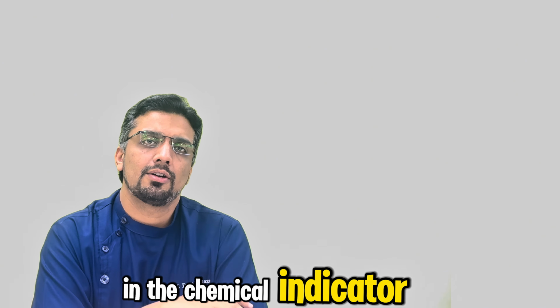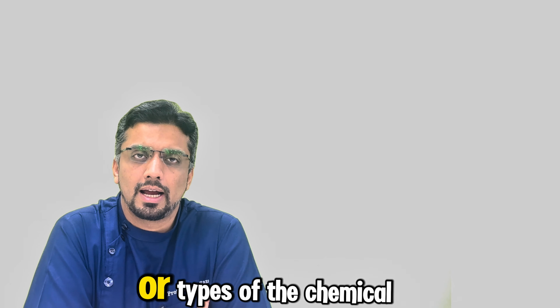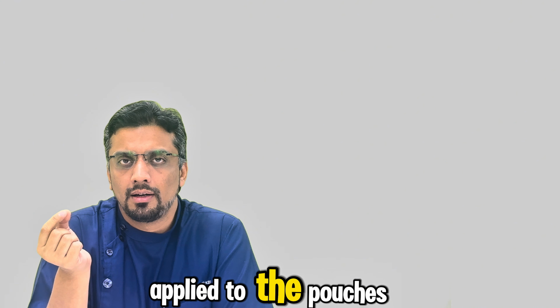Secondly, in the chemical indicator, we have 6 different classes or types of chemical indicator. Types 1, 2, and 3 are not very sensitive. They just tell us that the sterilization process has been carried out, that there is a change in the pressure and temperature, and that steam has been applied to the pouches.